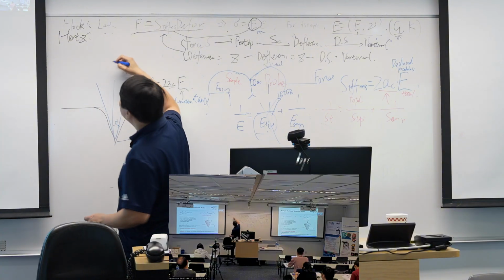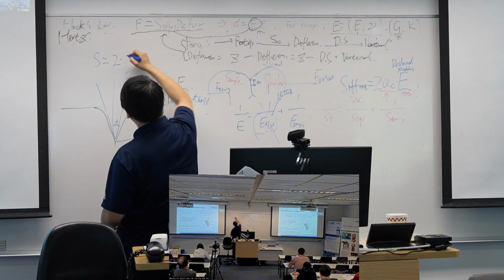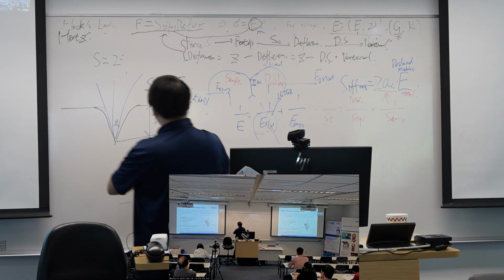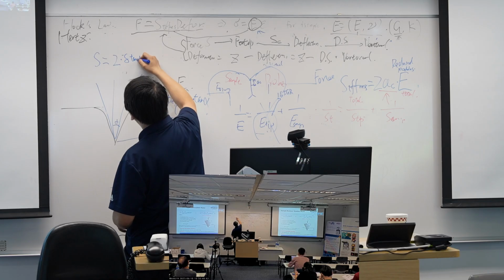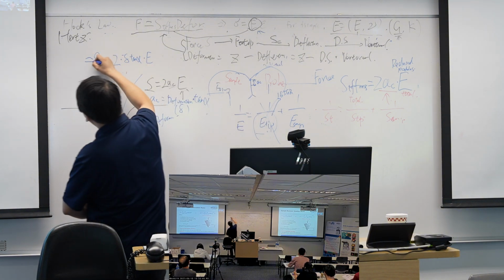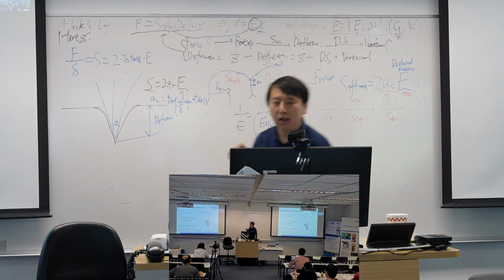So stiffness equals 2 times deformation. The deformation, I would use delta to represent deformation. So it's delta times tangent alpha times modulus. And the S equals the force divided by delta.